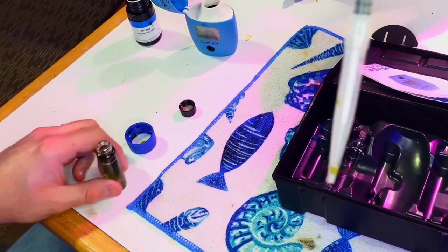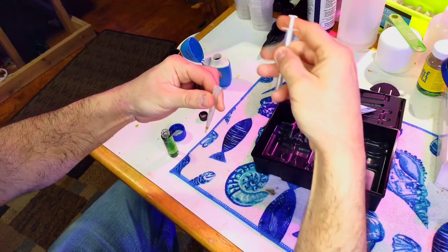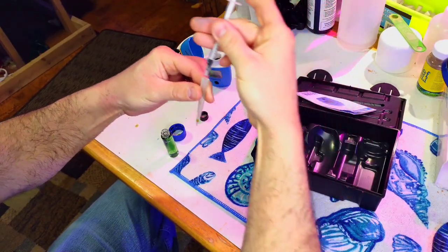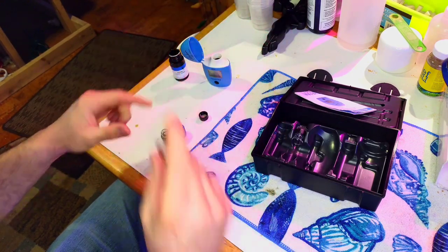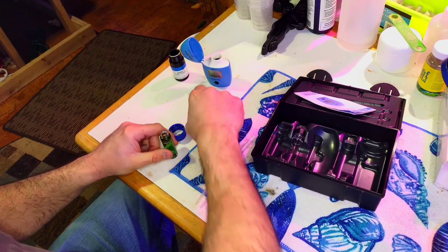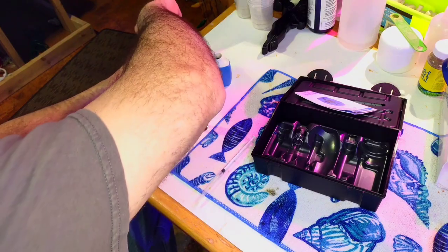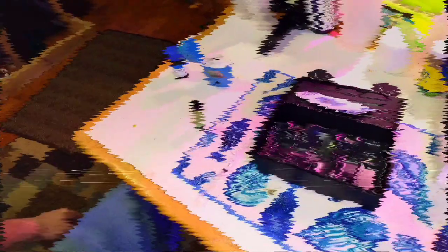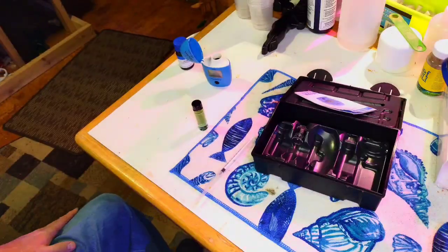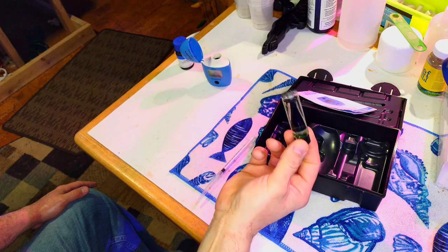If you end up with a little bit of reagent left in the syringe and want to get it all out, take the adapter off, pull up the plunger a little bit, put it back on, then push it down back into the vial — that gets the rest out. It may or may not affect the reading, but it's good practice.